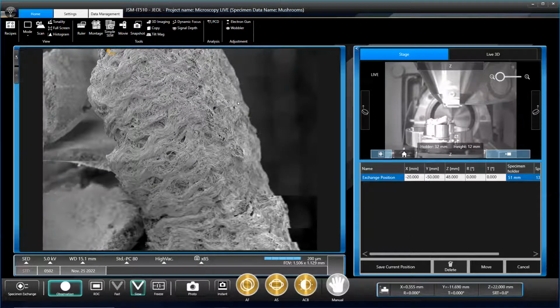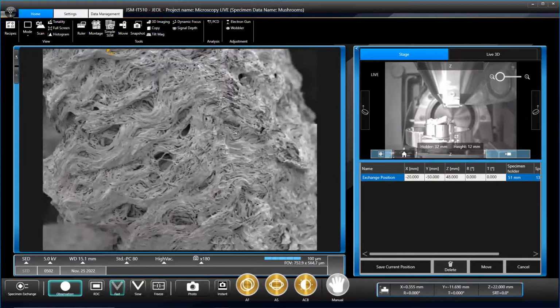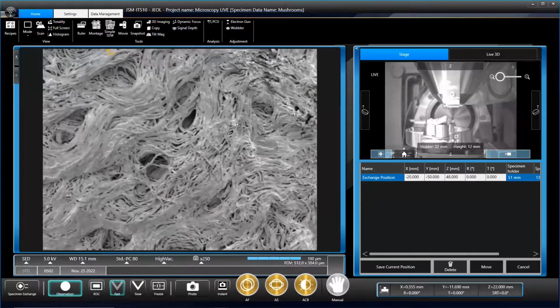So what are we looking at now? So the gills, these bits of gills. Is this part of the cap maybe? I think so, because this does look like the little filaments and tubes again, doesn't it? They're kind of trumpety shaped. So I think that might be the underside of the cap that's sort of rolled forward.